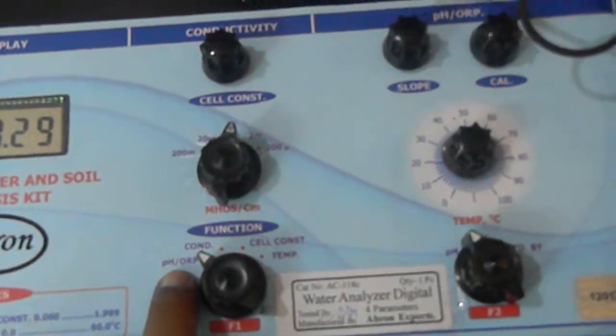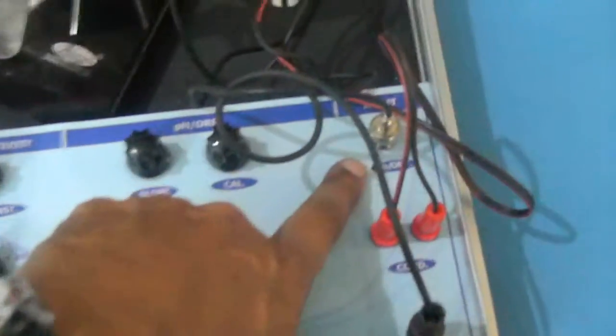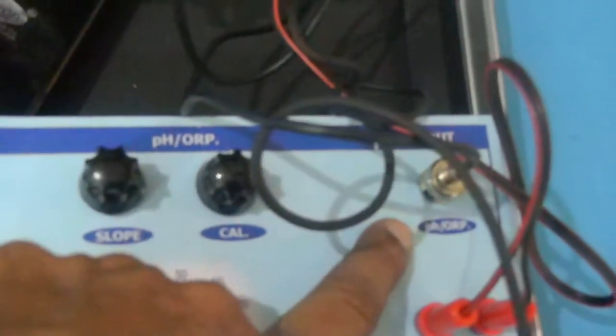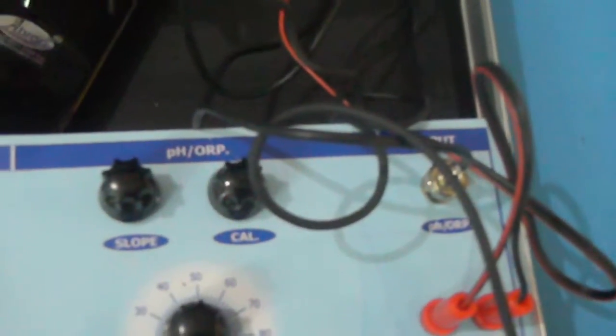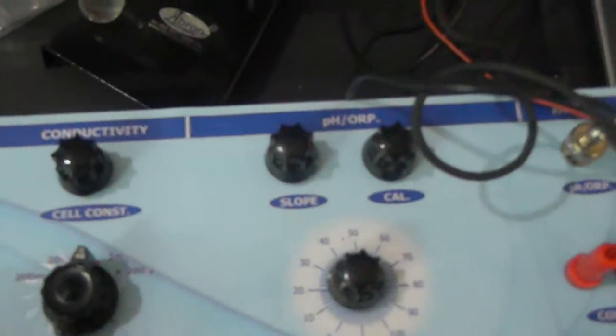You will see some display. Put it on pH mode and connect the pH electrode. You can connect the pH electrode to the pH, and there are points for connecting this electrode. Then this temperature which is visible can be selected to see the temperature.